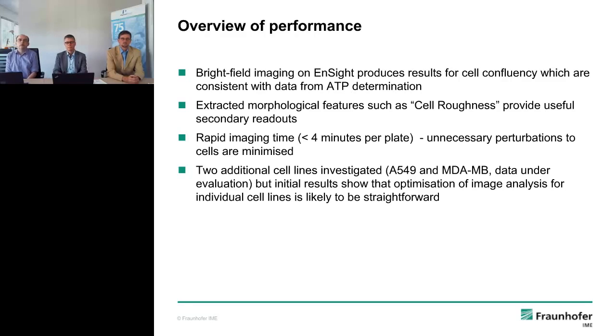In terms of imaging time, that was less than 4 minutes per plate. I think that's pretty good. It's not the same kind of system as one whereby you would have your plate inside an incubator, as some reader systems are. I think you can rapidly read the plate and then put your plate back into the incubator, so there are no unnecessary perturbations to the cell.